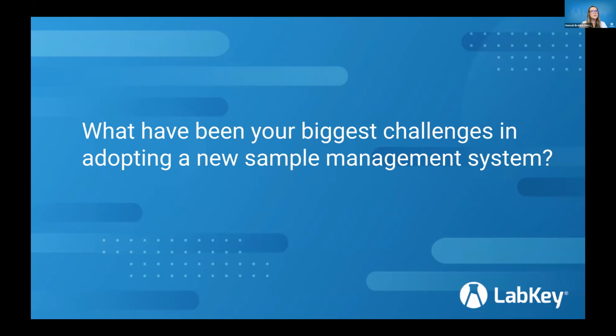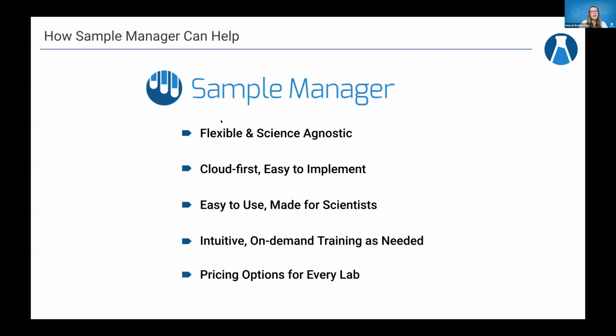Typically this becomes very challenging, and then kind of even split with the rest of these. And so what I want to talk about is how Sample Manager might be able to help with some of this for you. And if you're struggling from that lack of appropriate tools, remember that Sample Manager is designed to be science agnostic, which allows for lots of different teams and disciplines to use it.